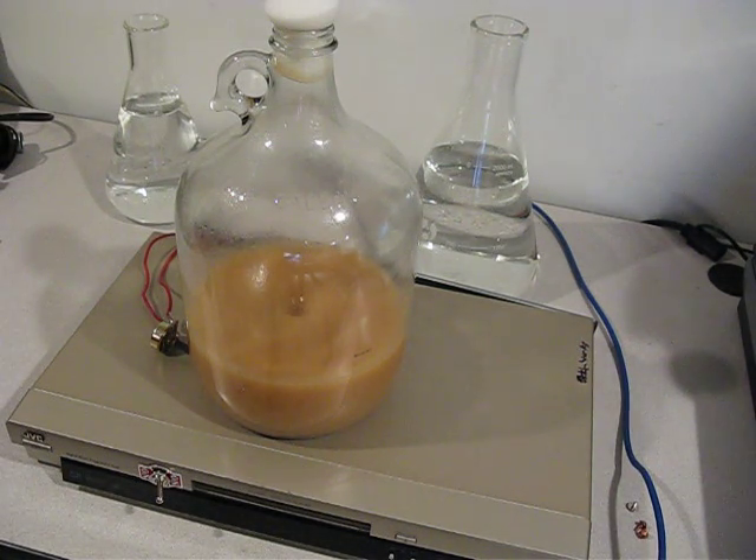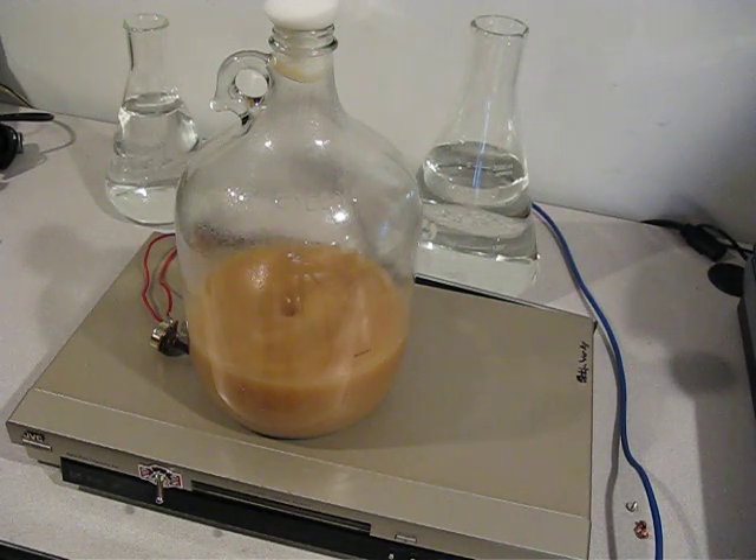This is an update on my homemade do-it-yourself stir plate that I made inside a DVD player. I added a computer fan and an earth magnet taken out of an old hard drive. I superglued a big washer on top of the fan, and the earth magnet just stuck solid to that. That seems to be a good way to do it. I first tried Velcro, but the Velcro caused the magnet to warble a little bit, which kept making the magnet bar fly off inside the flask.